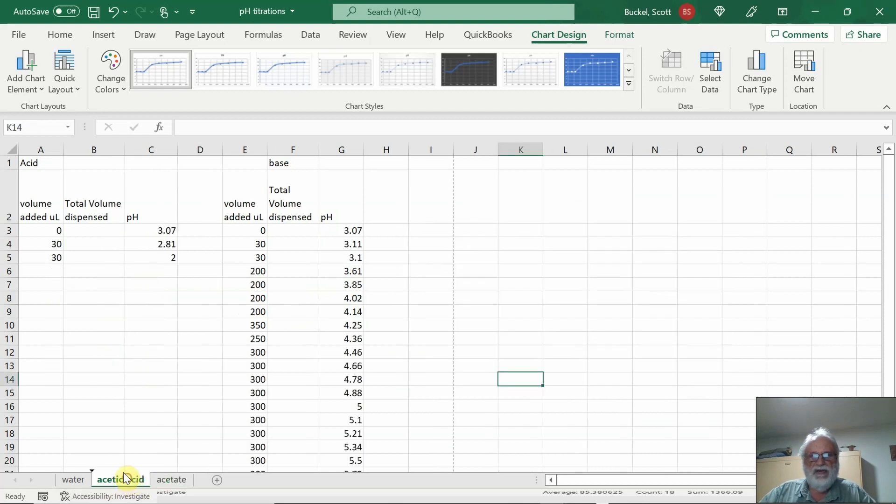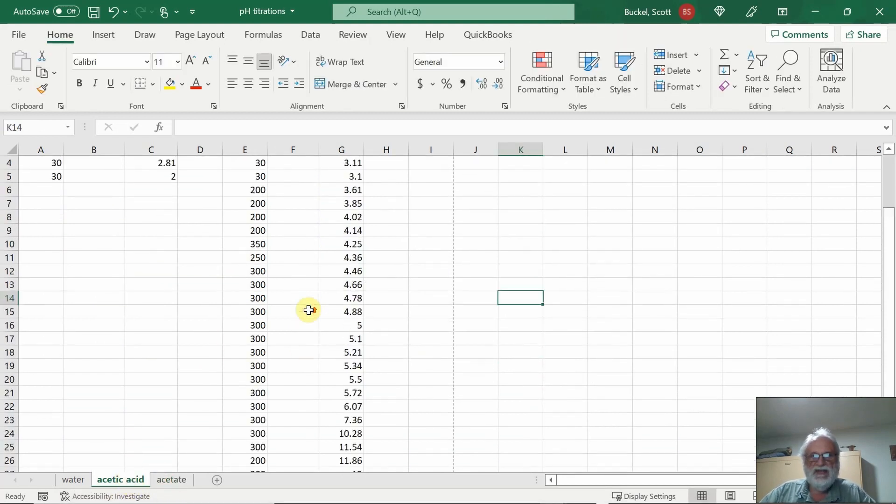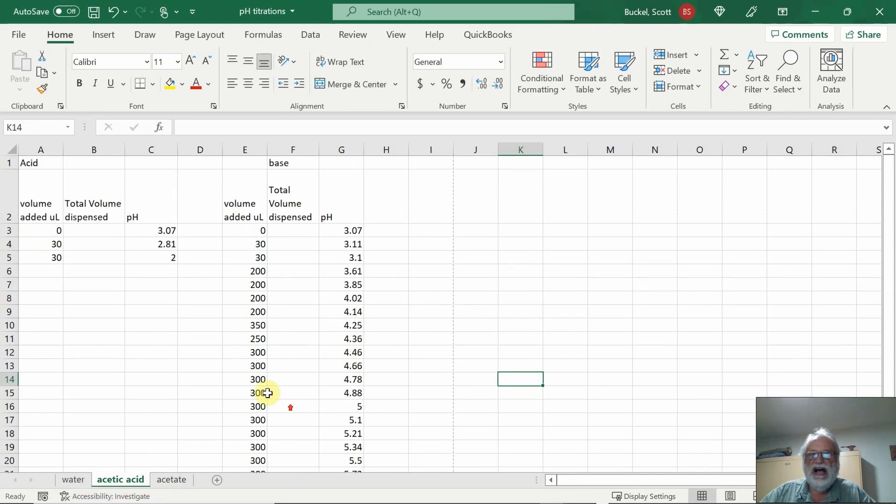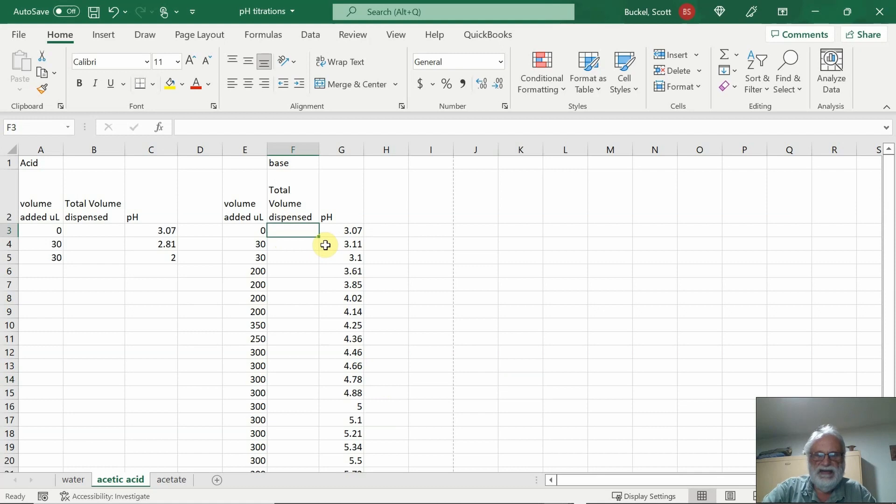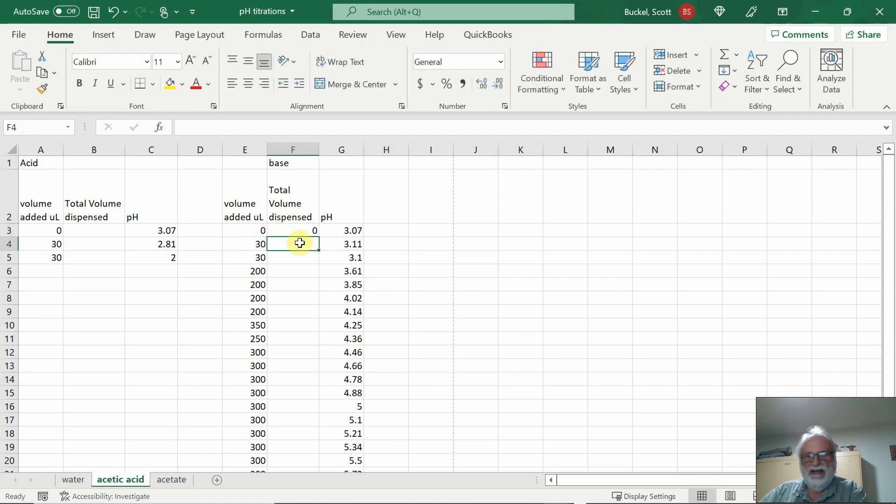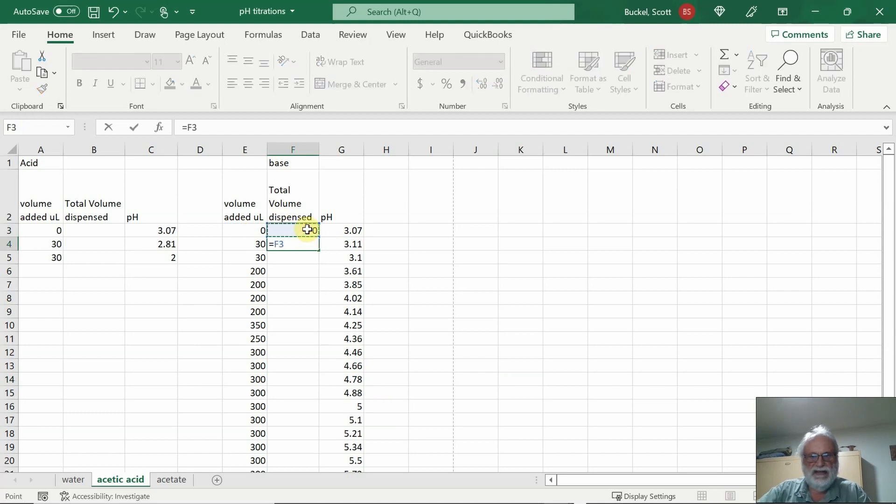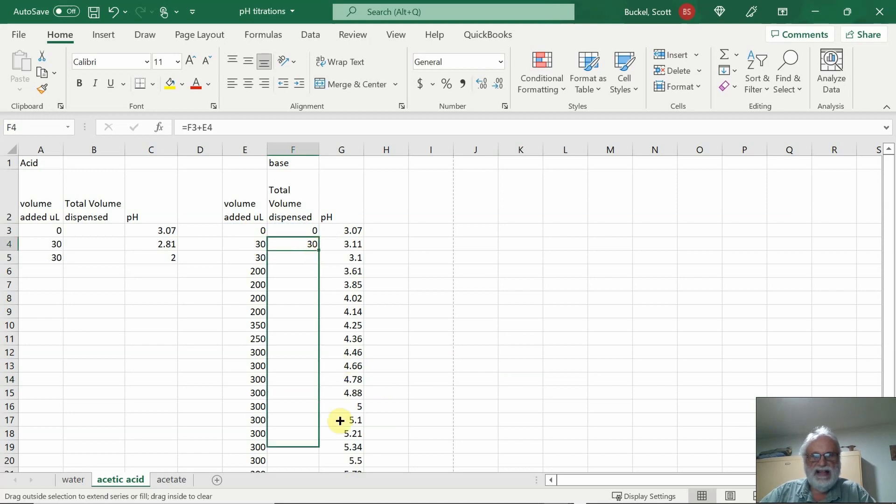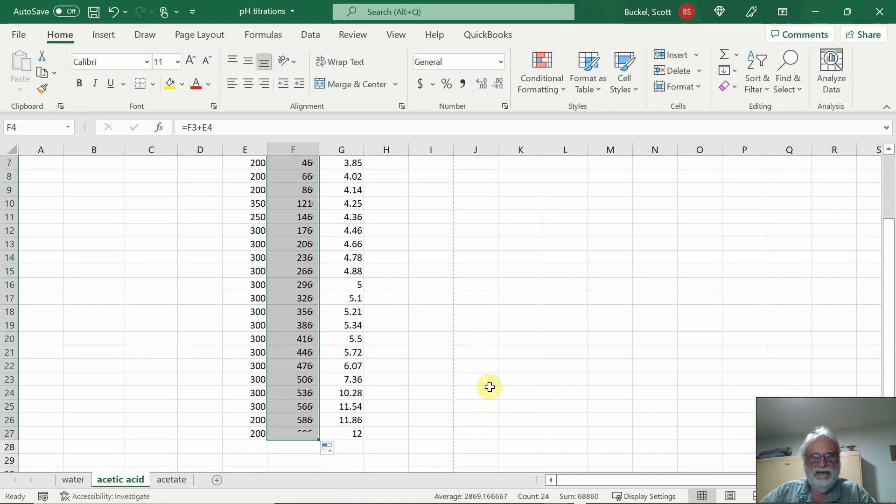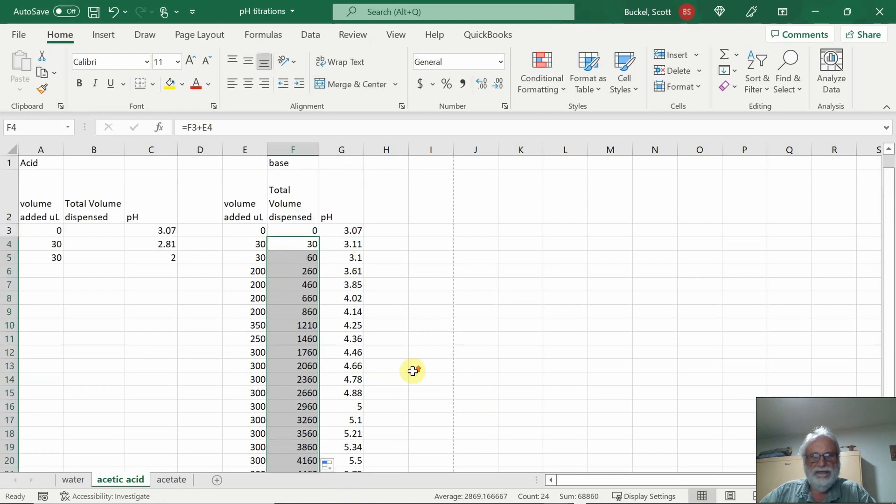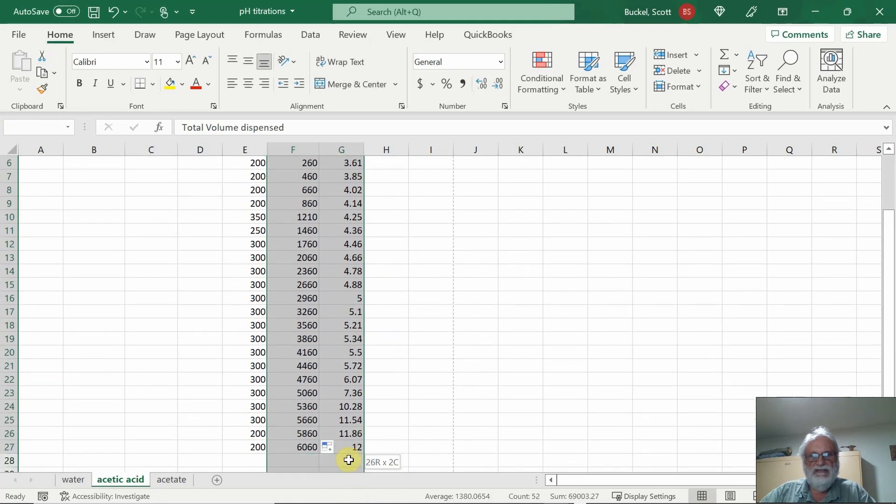Let's go ahead and I'm going to go through the same thing once again. And this will be a case where there's a whole lot of points on one side and not very many points on the other side. That graph will look a little bit different. I want you to see what it's going to look like. So what I do here is do the same thing is equal to this. This is total volume entered is equal to this plus that enter. And then you just grab that one and just drag that down to the bottom here.